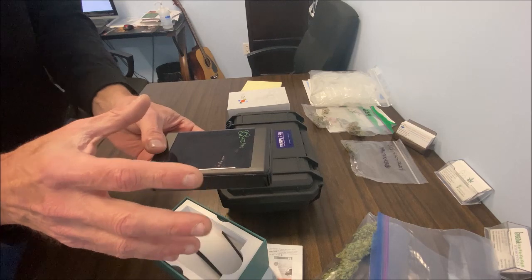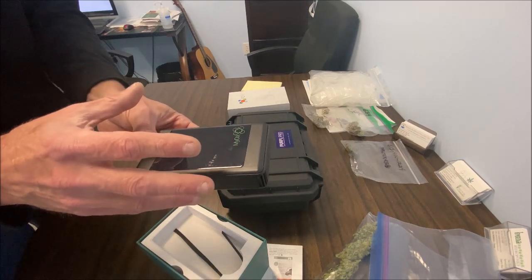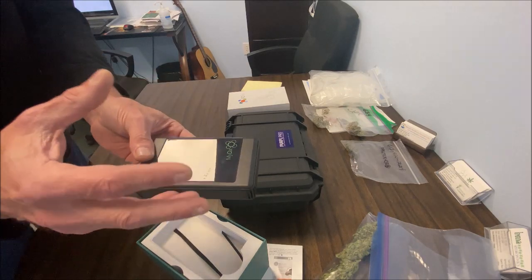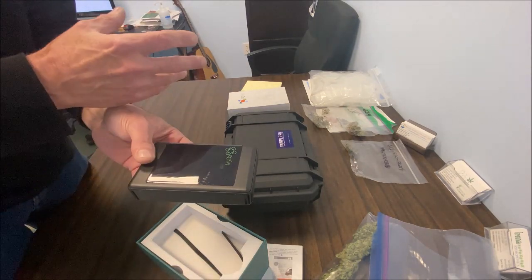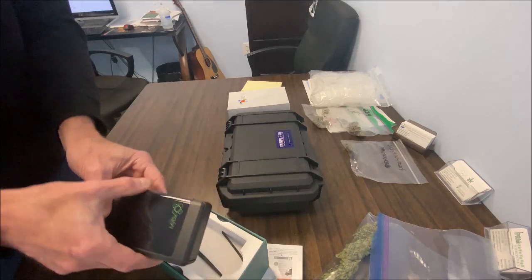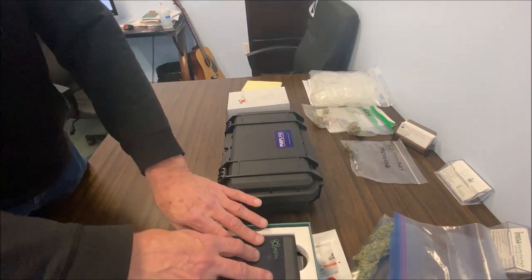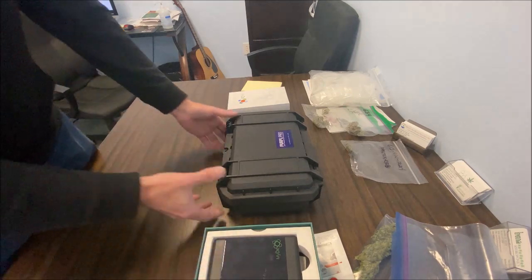Terpenes are very important with cannabis. They have a lot of bearing on how you feel your cannabis. In other words, 18% could feel like 20%, it could feel like 16%, and that's because of terpenes. So terpenes are important, and it's a longer test and it takes longer, so it costs a little more at $30.